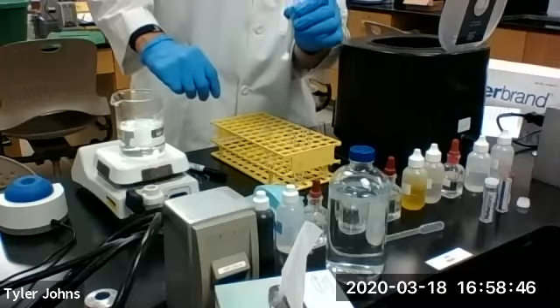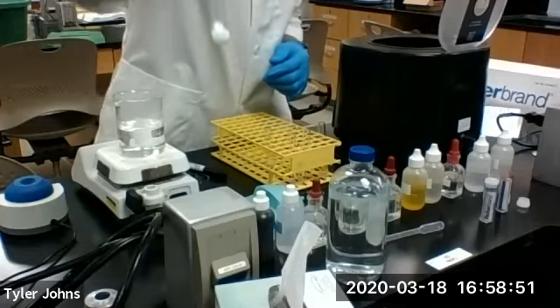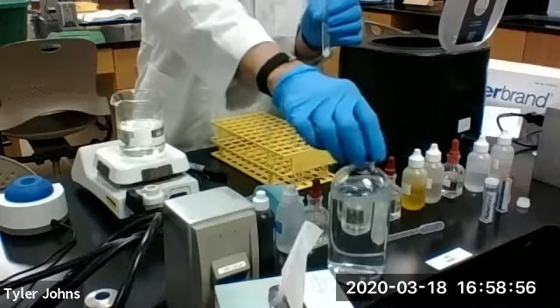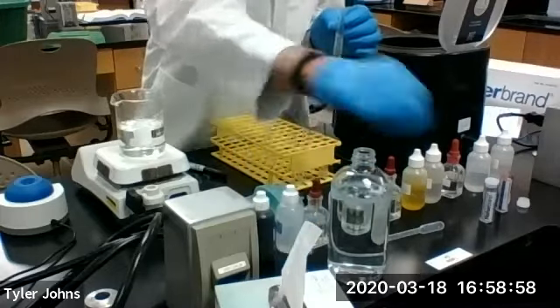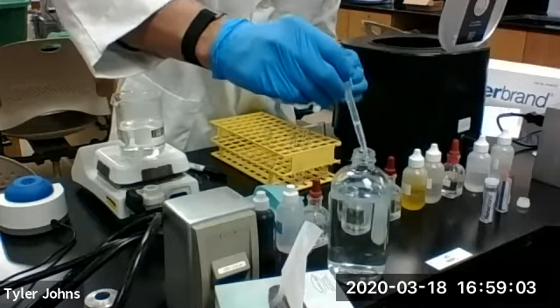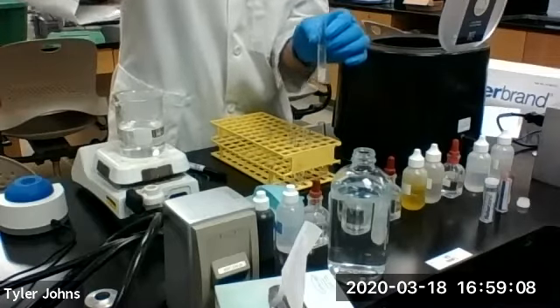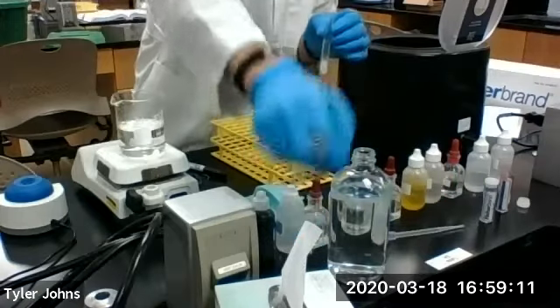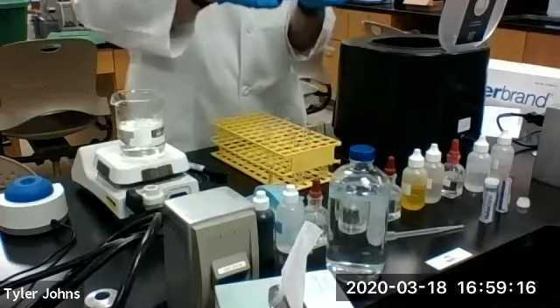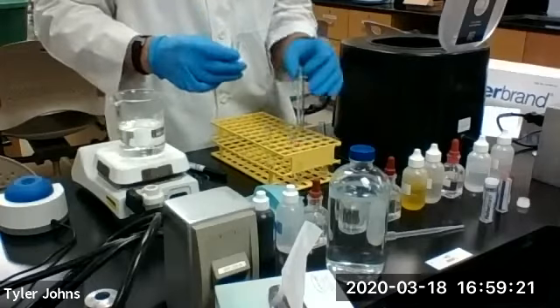To begin with, we are going to test for barium ions in our R14. So we're going to wash residue 14, R14, with 1 milliliter of deionized water. We will then discard the washings.